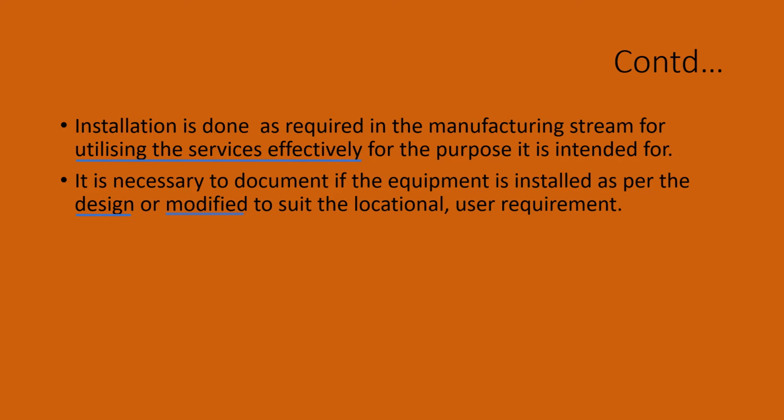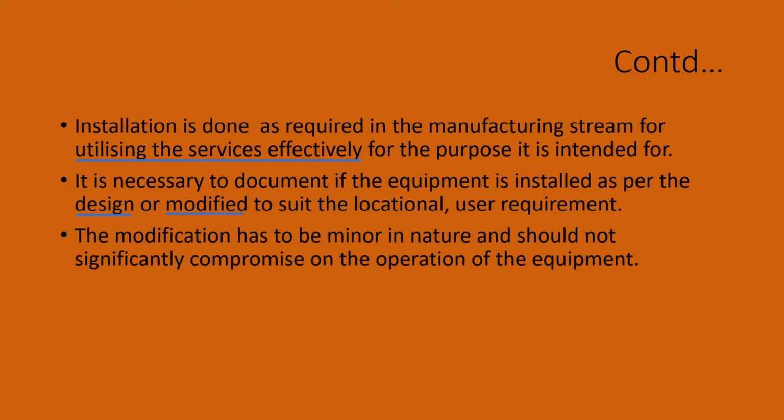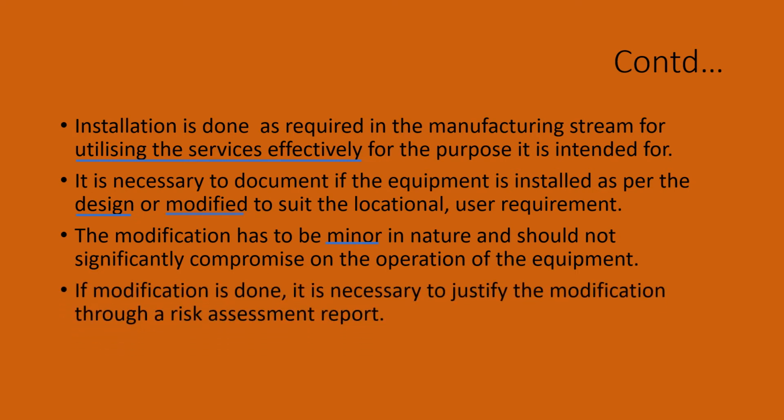Modifications, if any, have to be justified. The modification has to be minor in nature and should not significantly compromise on the operation of the equipment. So the requirement is that the modification should be to the minimum extent and not to compromise on the basic operating principles of the equipment. If modification is done, it is necessary to justify the modification through a risk assessment report.